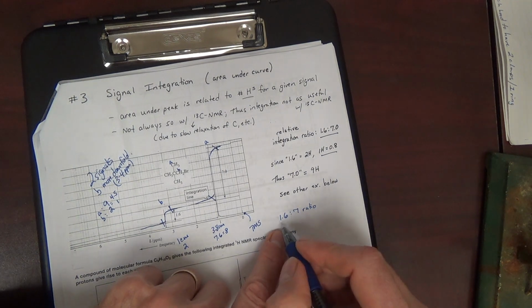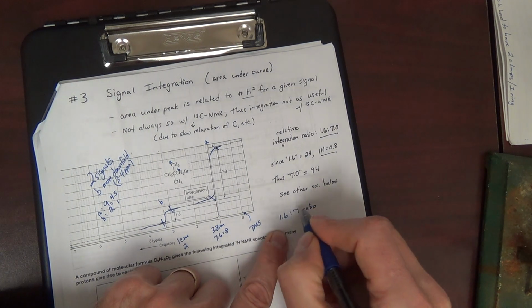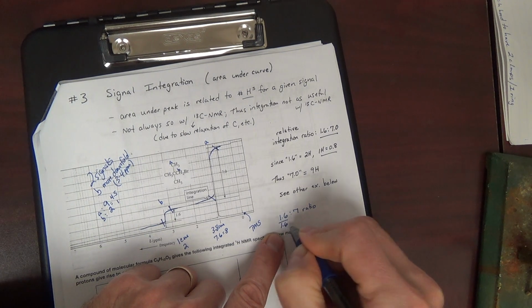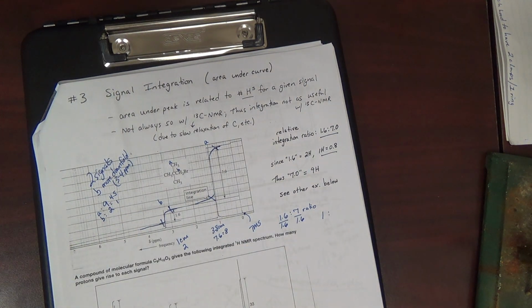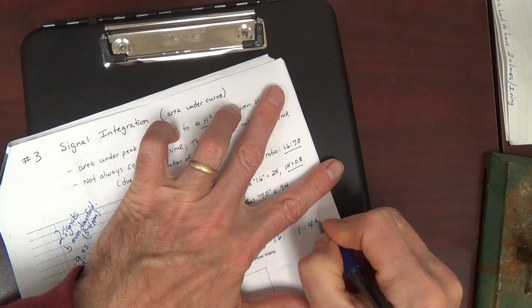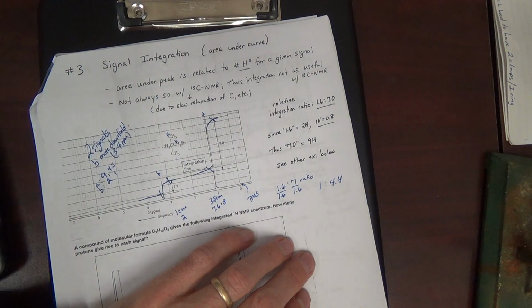All right. Well, you can't have 0.6 hydrogens. One way to do this is to divide both numbers by the lowest number. Divide this by 1.6, divide this by 1.6. This becomes 1, and 7 divided by 1.6 equals 4.4. All right. It's actually 4.38.